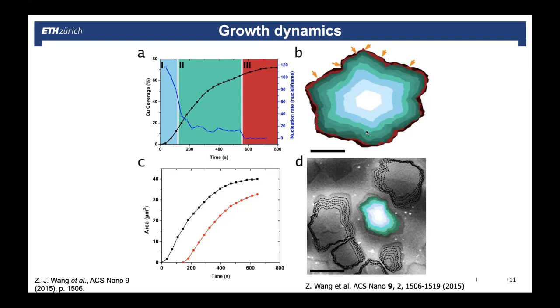And we can see that this is very funny. So when we look at different grains of graphene, we looked at some that had lots of other graphene grains in their surrounding. And we could see that the ones that had other graphene islands nearby didn't grow as fast, they were growing slower. They were also growing fast when everything was far apart, but when the graphene flakes grow larger and the free catalyst surface area gets smaller, and nearby ones are also feeding on growth species, when they're getting close, they start to compete for growth species, and then they actually stop growing. So that's also the reason why nearby flakes don't want to grow together, because they're feeding on growth species. There's a kind of growth competition. And all these nice things you can see and study in detail.